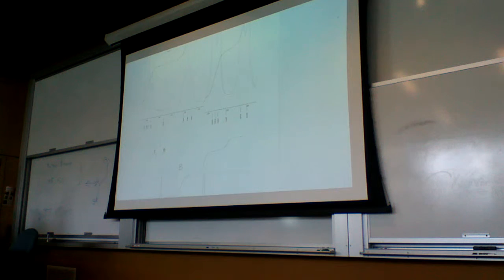Then if we look at C and B, the common number is the 15.5, which I understand is hard to read. But that's 15.5 there, and this one's 15.5. So the JBC value is 15.5. And then between B and A, the common value is the 7.25. So write the assignment on the peak, and then match the J value, or the hertz values, and you can match them.